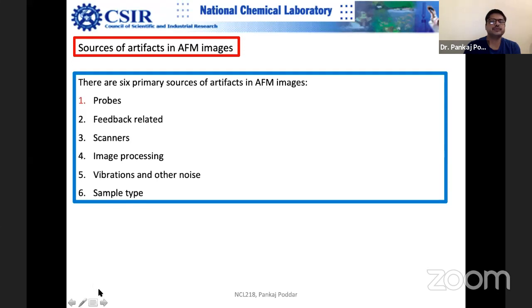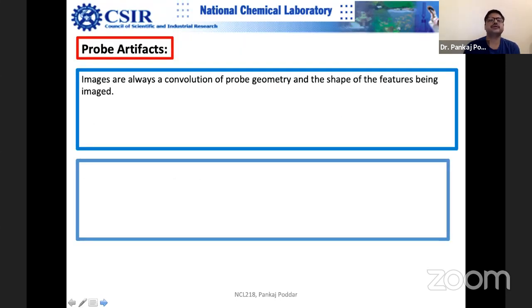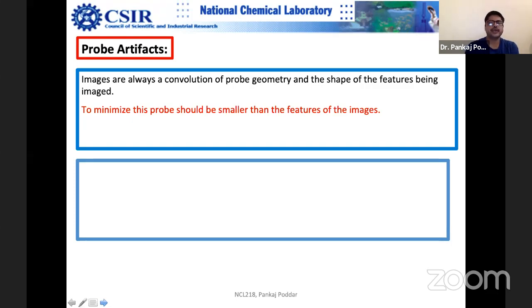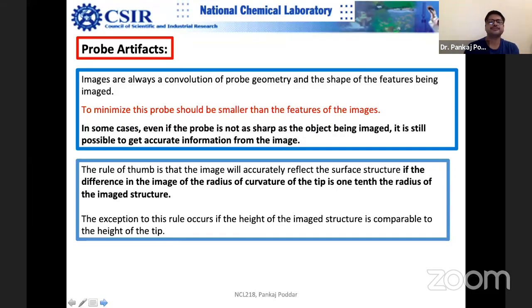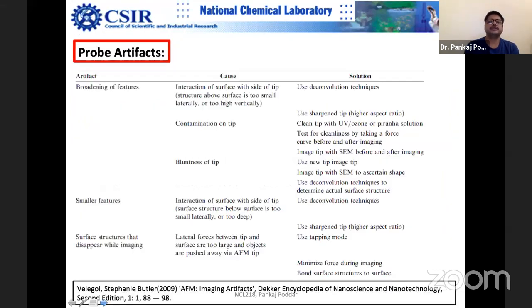Let us start with the probe. I am going to spend a lot of time on source number one. The idea of the probe is you would like to have it as small as possible, representing forces as close as possible, but it doesn't always happen. The probe is sometimes not nicely characterized. The rule of thumb is that the image will accurately reflect the surface structure if the radius of curvature of the tip is one-tenth the radius of the imaged structure.